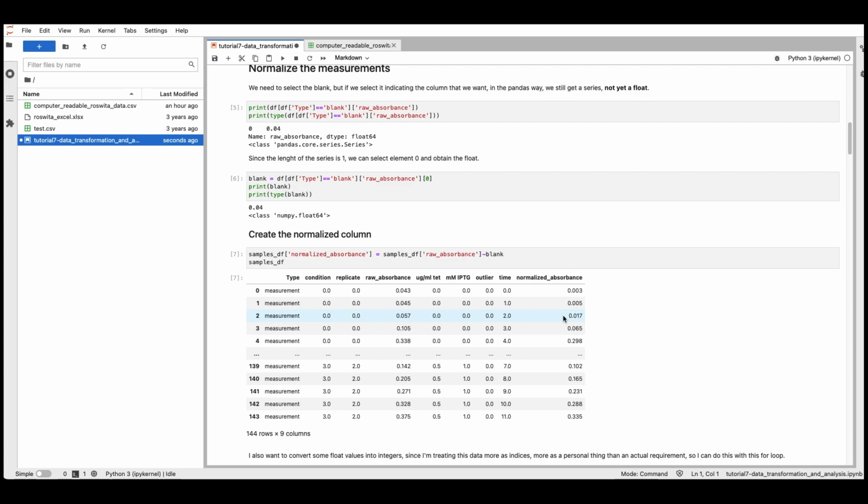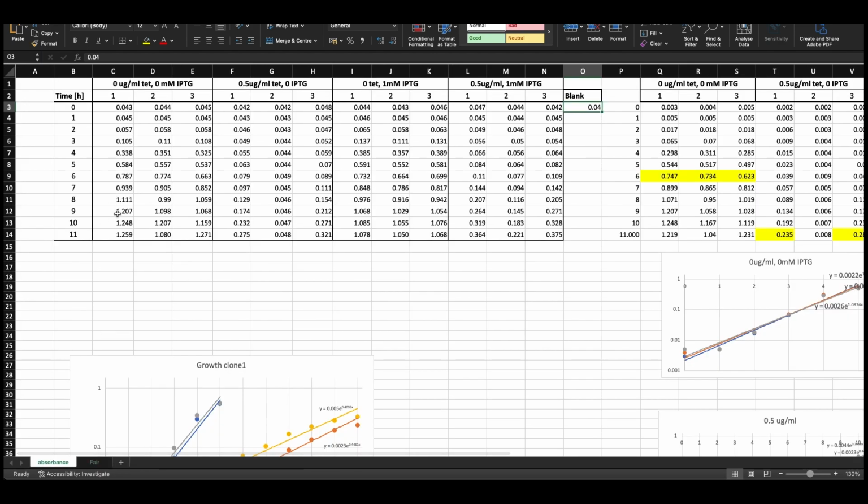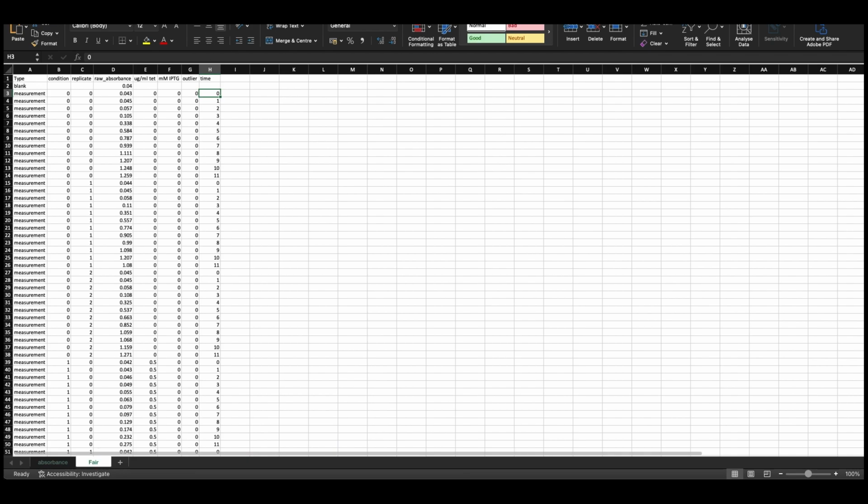And just by doing that, one doesn't have to start copying columns and adding some conditions. If you already provide it in a way that is FAIR, more FAIR than the previous one, it's much easier for the data to be reused and to be interoperable with other data sets.